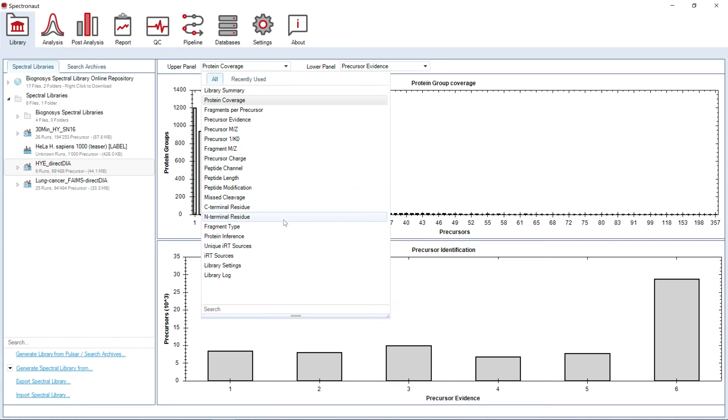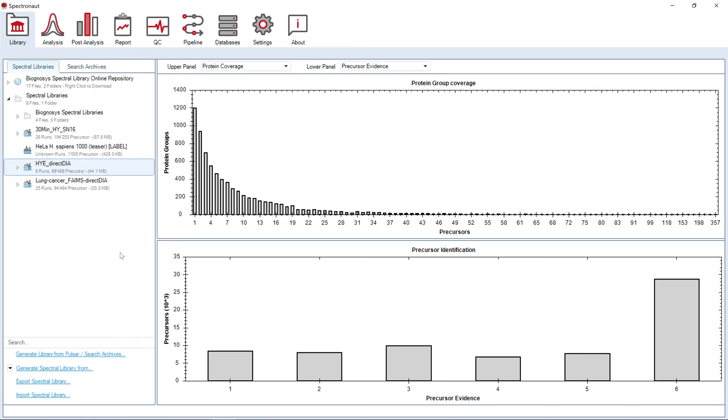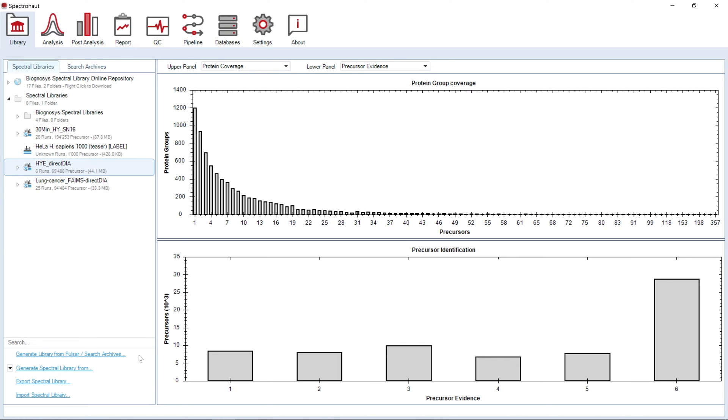The information presented will be helpful for DIA method development and optimization. We highly recommend generating spectral libraries directly in Spectronaut with the integrated search engine Pulsar.